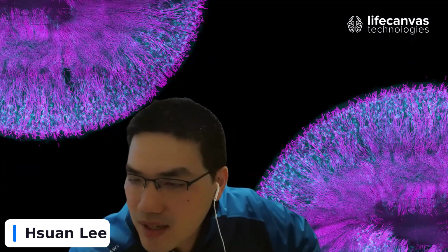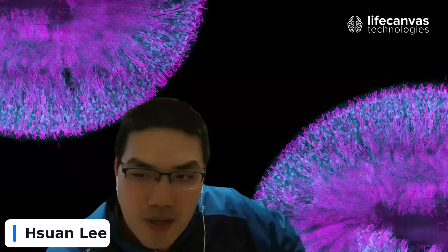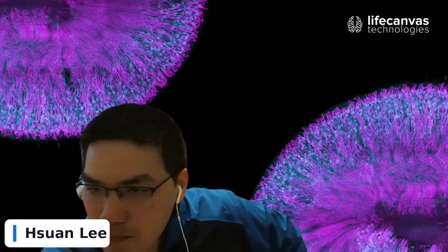We actually got another question from Michael Anderson. This is for Clarence. When you do multiplex imaging, are you using clear samples? If so, can you do restaining and bleaching in RI matched media?